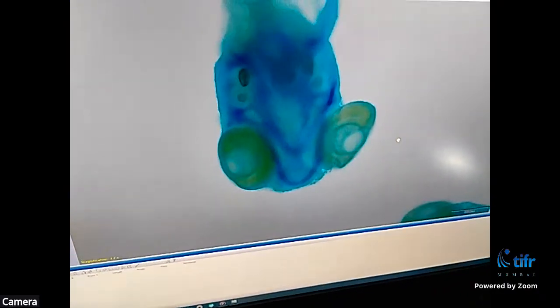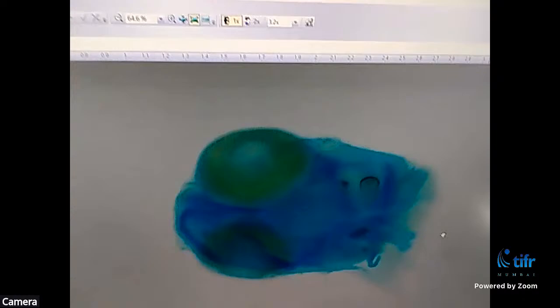Now, I also have two samples where I have just the head. So this is the zebrafish head looked at from the bottom. What you're looking at is the lower jaw of the zebrafish, and you can see these several rod-like cartilages, which are called the Meckel's cartilage in zebrafish. And again, this is the zebrafish head from the top.